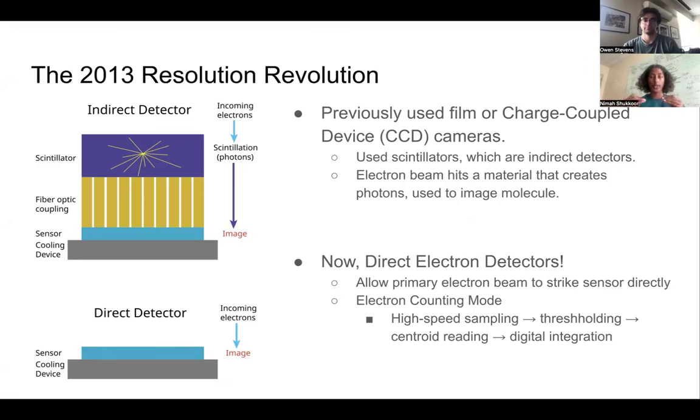When that happens, the resulting charge may spread across a grid of pixels. The camera's hardware is able to mathematically determine the center of this grid, which is good because using the next step, which is digital integration, the software is able to record a peak or a specific digital signal at that specific coordinate, and then discard the remaining cluster data, which basically just eliminates the variations in the amount of charge deposited by electrons, which means you get minimal scattering and minimal noise, and you get very high resolution readings.